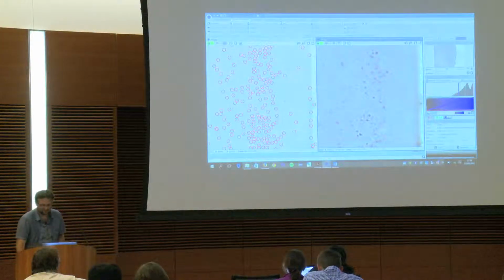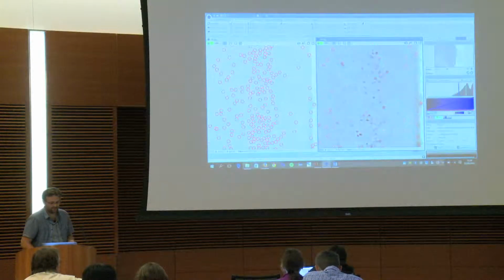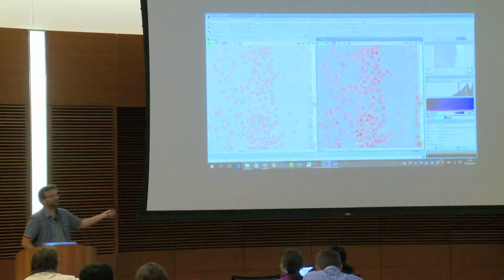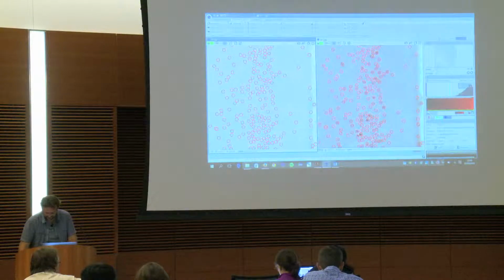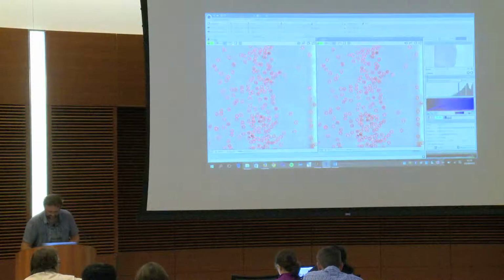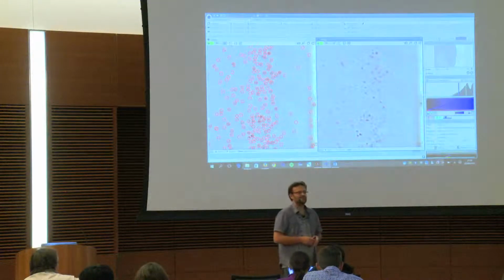There's something else that I could do, is being here and make it blink, like that. Okay, so I put it a little bit like that, a little bit like that. Or I do the same here. You say it's a good job, okay.